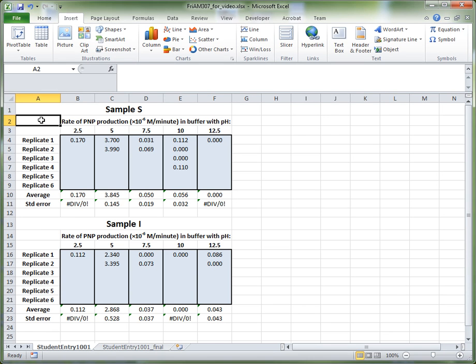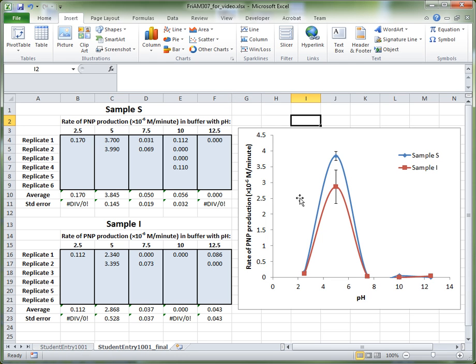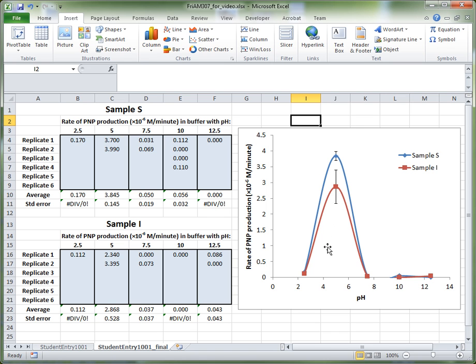In this video I'll show you quickly how to use Excel to construct a graph that represents your enzyme activity data. What we want to end up with at the end is something that looks like this. What we have here is an XY scatter graph, and this shows on the Y axis the rate of PNP production, and on the X axis the pH. From this graph you can very quickly and clearly tell that there's a peak in activity at pH 5, which suggests that the type of phosphatase found in these cells is acid phosphatase.